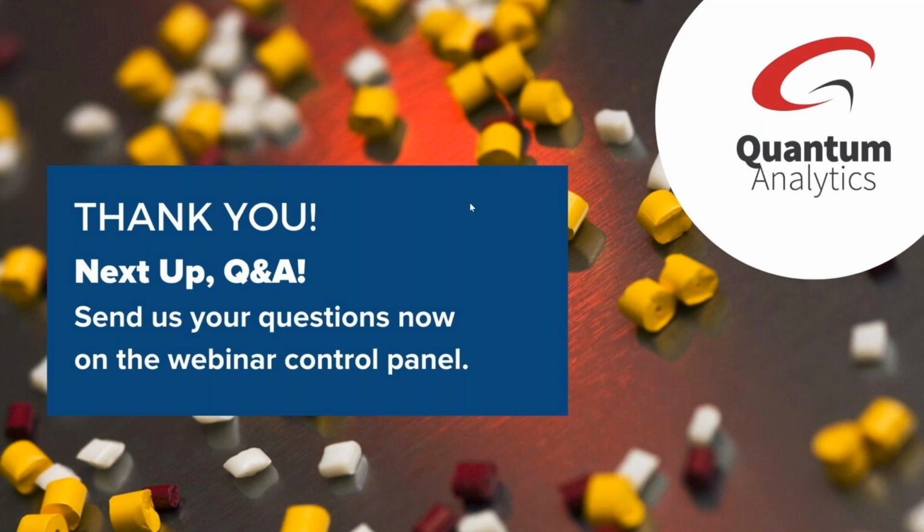All right, looks like we have one more question here, unless I get a question snuck in here before this one gets answered. But can the polymer density be determined? That's another really good one. So the density can be determined if it's something that's been known and well characterized, like polyethylene. You can look at the density very nicely, and that's been shown in the literature.